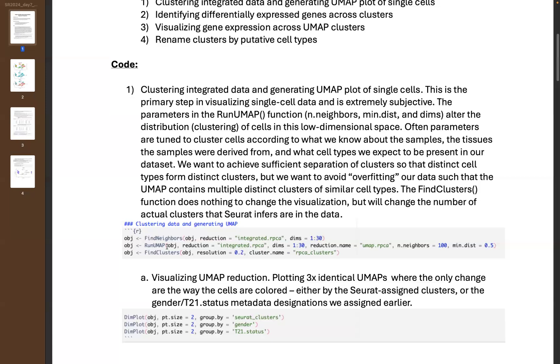When we run the RunUMAP function, we take our object that we already ran FindNeighbors on. We're asking it to look at the integrated RPCA data slot — the data that was integrated from our previous day using the RPCA algorithm. Everything after this — the DIMS, the n_neighbors, and the minimum distance parameter — these things are all very tunable.